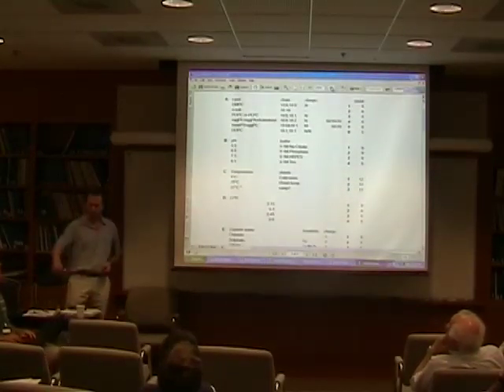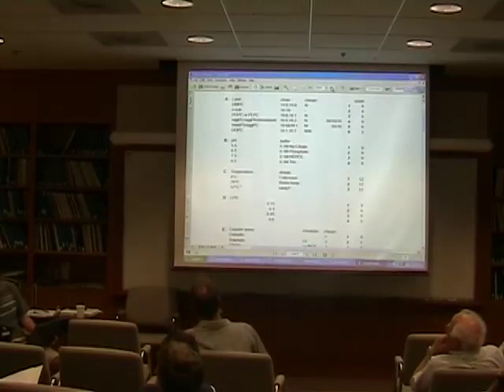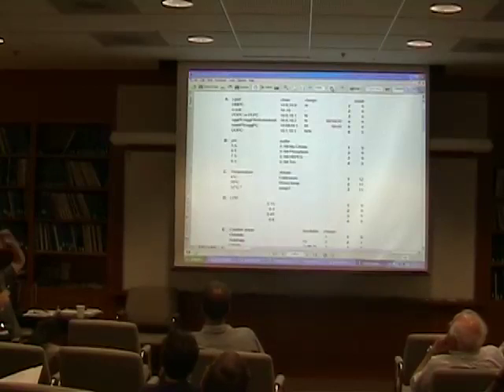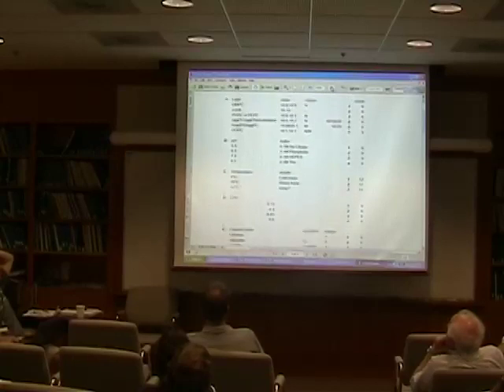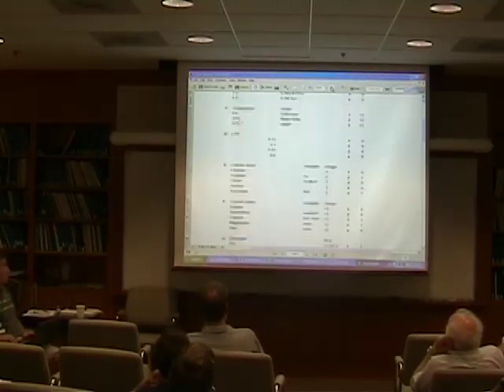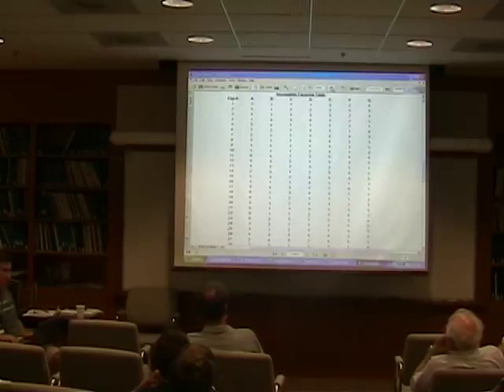Okay. All right. So you can easily drop any of these parameters at any time. So if, for example, you wanted to take the approach that Tom mentioned, where you pre-screen lipid and therefore lipid protein ratio separately, then you would just drop A and B out of the table. But these are the factors that we've got in there. So A, B, C, D, E, F, and G, similar to the one that Ben showed in his talk earlier today for the 3D approach to soluble proteins. And we've identified some important factors there. So obviously the lipid type, things we talked about today: lipid type, pH, temperature, lipid protein ratio, anion and cation, and detergent. All right, and then just array those into an incomplete factorial just by random number selection.